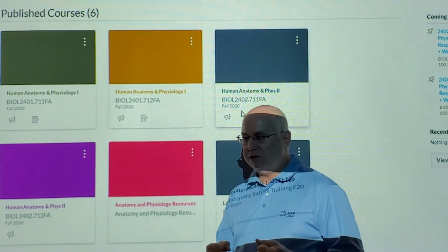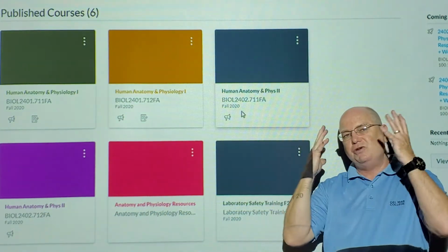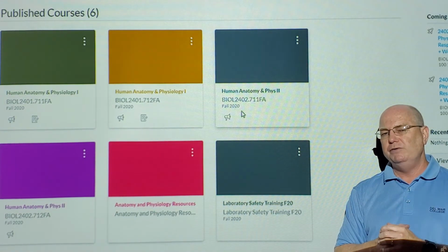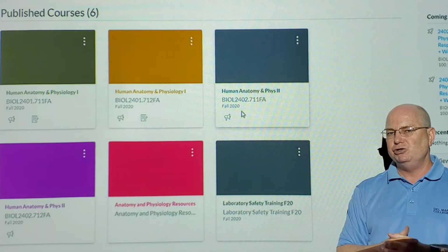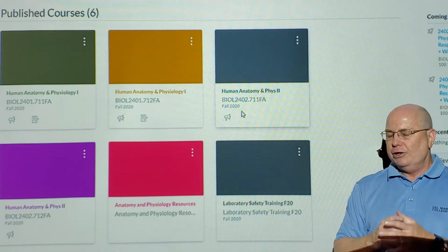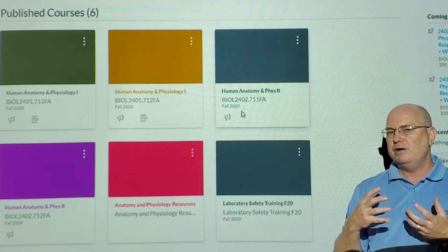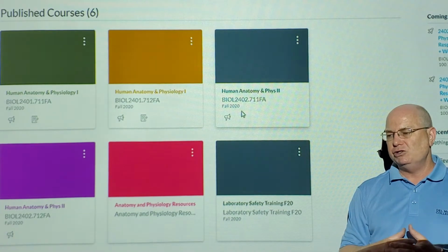So if you're in my class, what we've been doing here, let me stay over here because otherwise I end up with these stripes across my face. What we're doing is histology. This is the histology lab for lab test 1 if you're in my 2401 class. I'm going to be going over the epithelial tissues, okay? So you need to watch the introduction to histology video where I cover epithelial tissues and how they are named, and then the names will make sense to you.